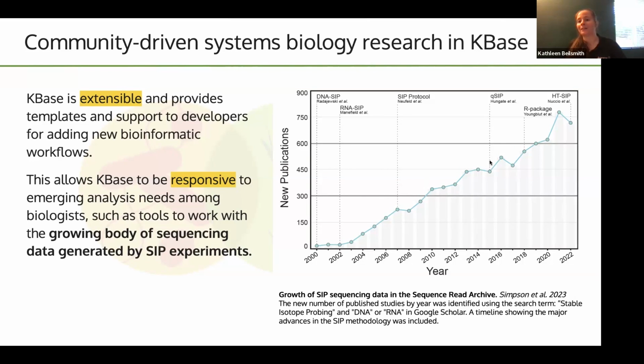And you can see a very clear trend here. There's a marker here for the introduction of qSIP. And one landmark that's not on this plot towards the end, but probably should be, is the introduction of an experimental pipeline for qSIP at JGI, which will certainly increase the accumulation of this type of data in the community by making the ability to produce it more accessible.